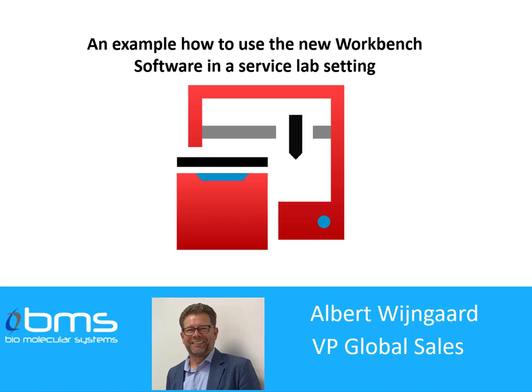My name is Albert Wijngaard and in this video I will show you an example on how to use the new Myra Workbench software in a service lab setting.